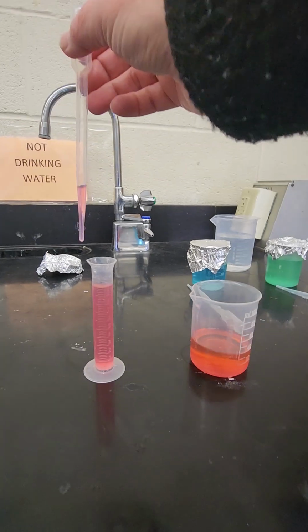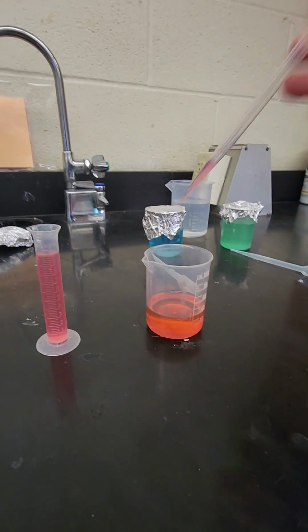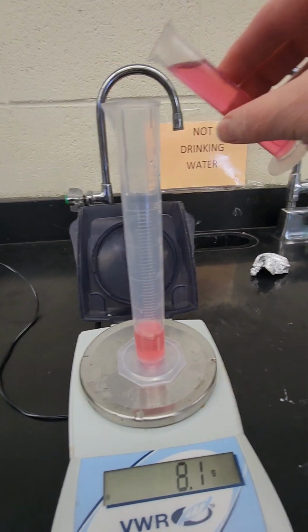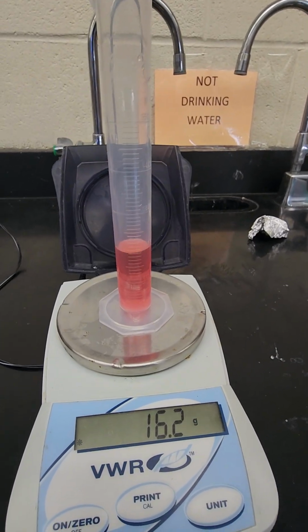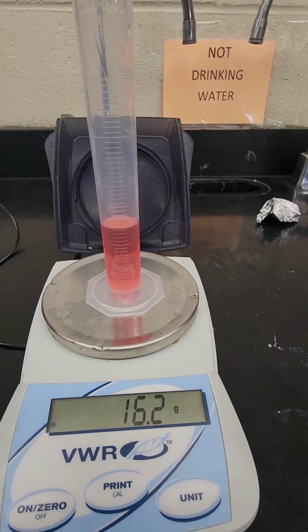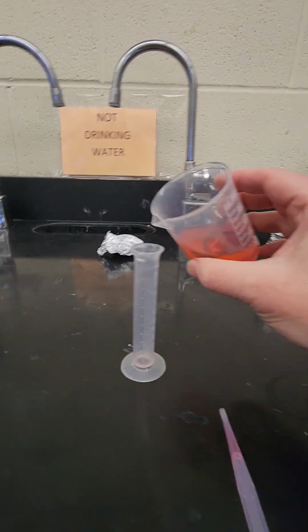Again, I'm adding what I need just to get the meniscus up to the 10 milliliter mark. Then I'm going to pour the next in, so now I have 20 milliliters total and a mass of 16.2. I'm going to write that down into the data table.